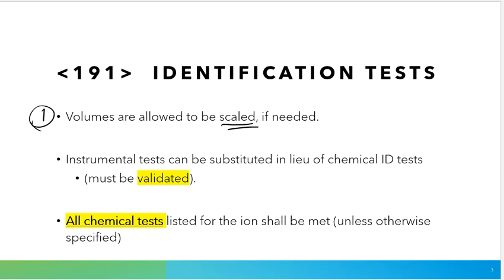But if they are scaled, then most of the time a company has to provide you with an SOP in order to make those reagents or solutions, meaning that we don't trust you with the math.